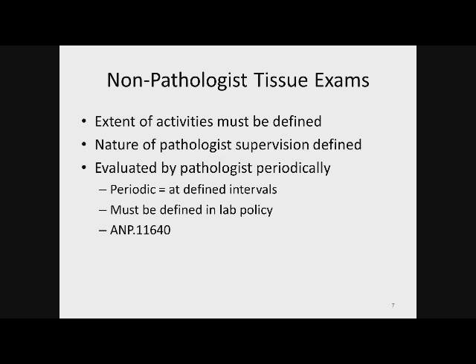So again, periodically indicates that it has to be at defined intervals that are spelled out in the protocol. This lab policy is something that during a CAP inspection they will take a look at in the anatomic pathology checklist 11640. Specifically defines the periodic intervals must review the grossing.